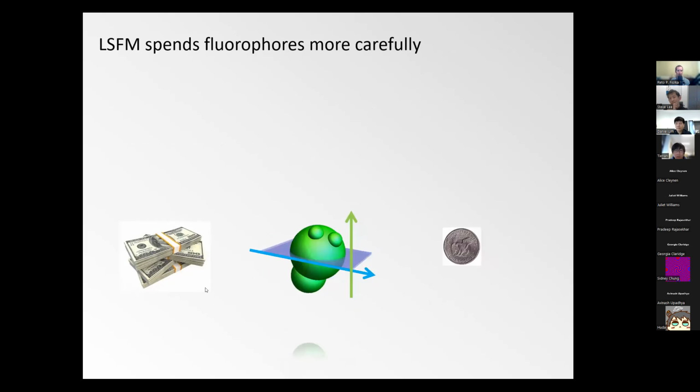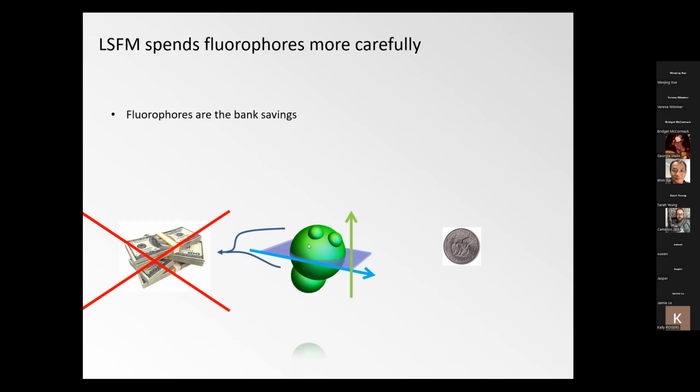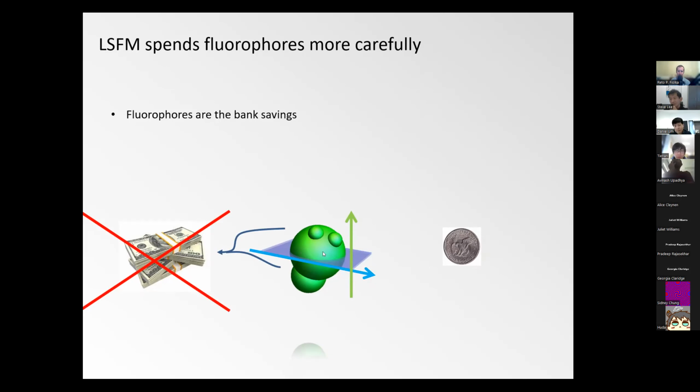And so the Lightsheet microscope is close to a bank that we're actually using. So when you make a withdrawal, you almost pay no commission. You only get photons that you actually use to form your image, and you don't withdraw any fluorescence photon from above and below. So you can essentially get them once you move the light sheet there and acquire the new image.